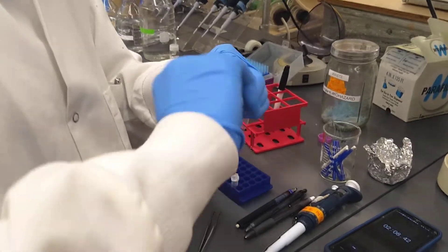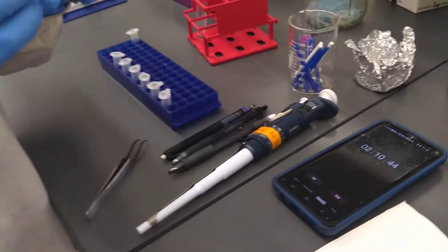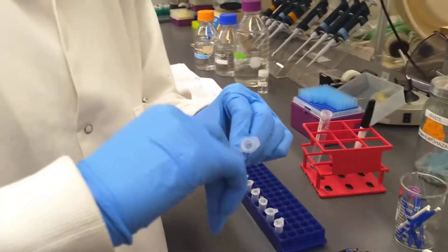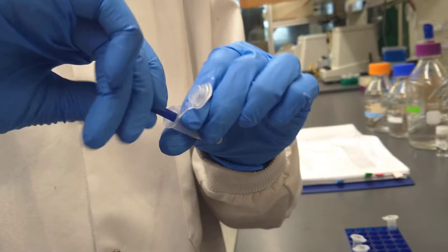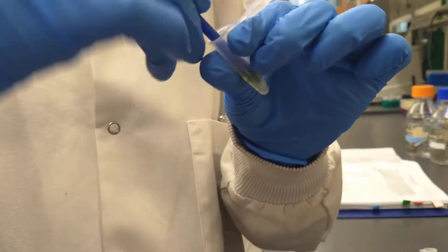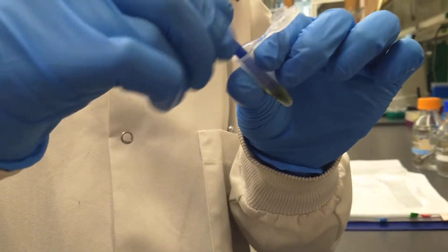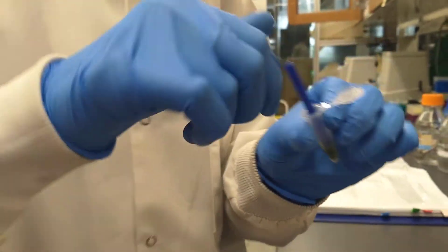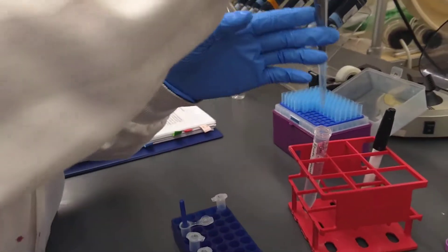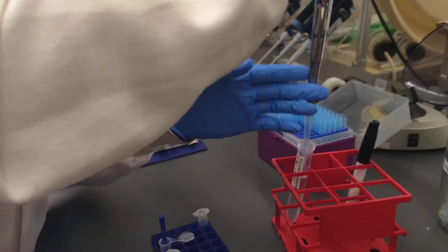Keeping track of the time as we grind — moving up and down, not letting any bit of the tissue hide. And again, 400 microliters of buffer.